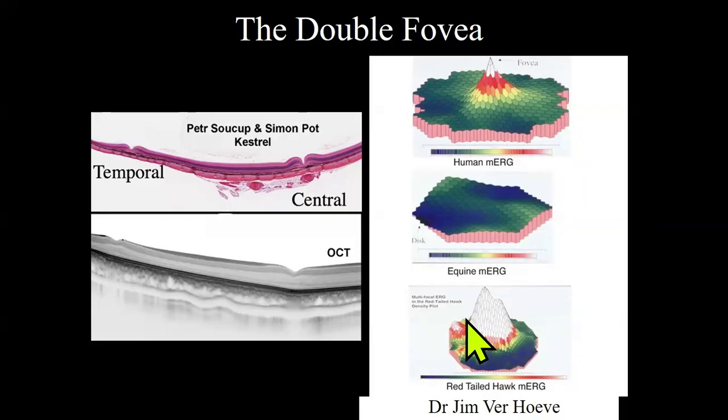While Doris is taking her photo, somebody asked a question in the chat here. Is it yellow only after it fixes in formalin? After it fixes in formalin is the only time I ever get to see the lens. I don't think so. Does anybody here work with unfixed ocular media? Mice have clear lenses. Those are definitely clear. But those aren't the species that we listed as having yellow ones. It's species that have high light exposure.